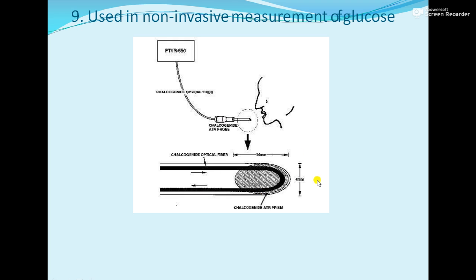Measurement of ethanol in breath can be done with the help of IR spectroscopy by a device called an intoximeter, so alcohol detection can be done. In fact, the measurement of paint varnish can be done by this IR spectroscopy method. This technique can be used for identification of old paintings and fake masterpieces also. So that's why it is very important.